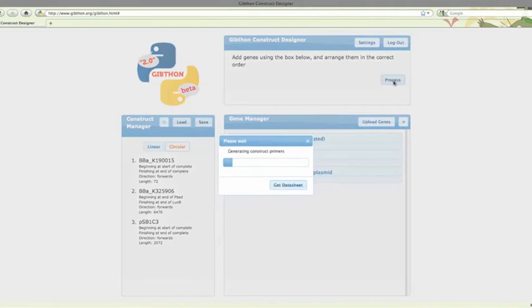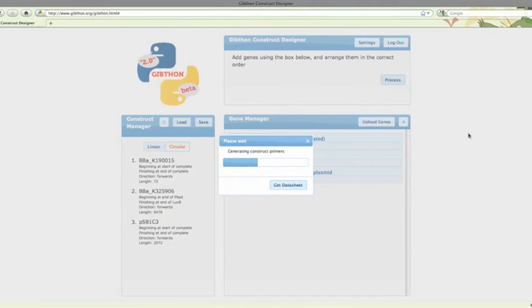Now hit process. This will take a little while, depending on server load, maybe up to 10 to 15 seconds for small constructs like this.